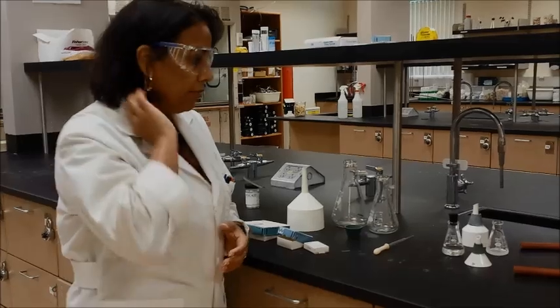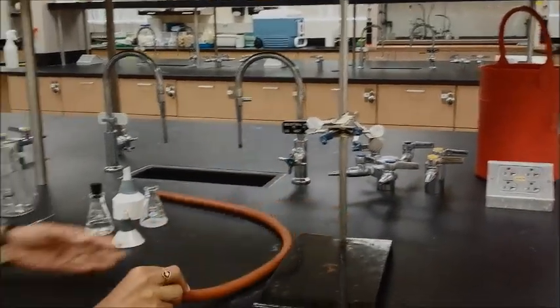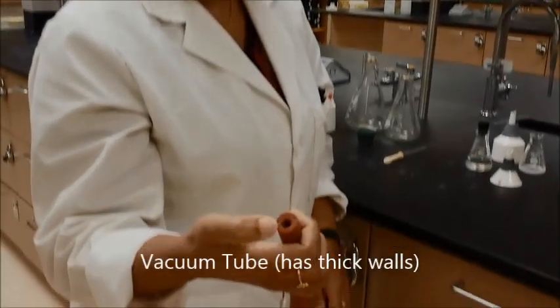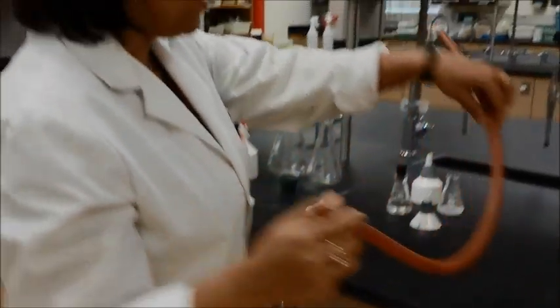You need a few things for vacuum filtration. You will need a clamp stand, you will need a clamp, you will need a vacuum tube, and a vacuum tube is what we call a thick wall tube. There are thin wall tubes also, just make sure you get the thick wall tube for vacuum.